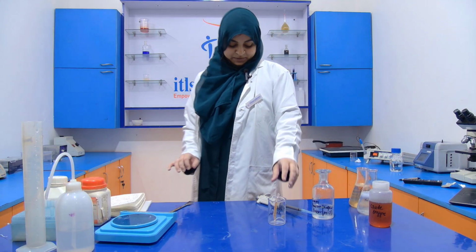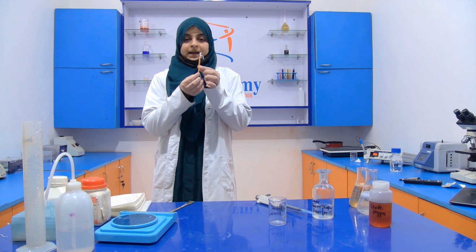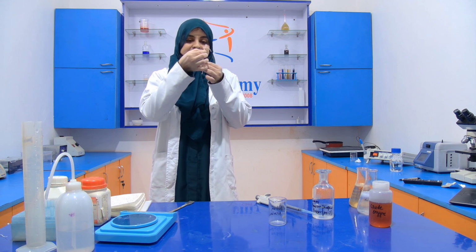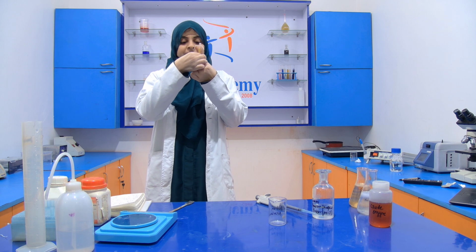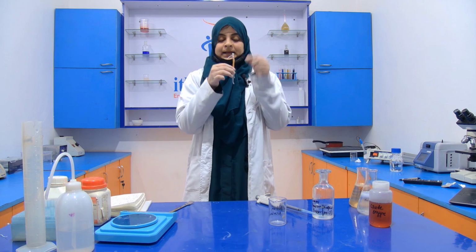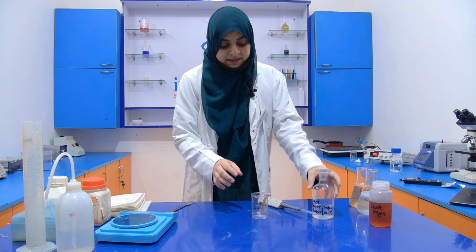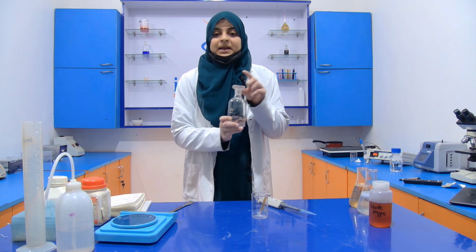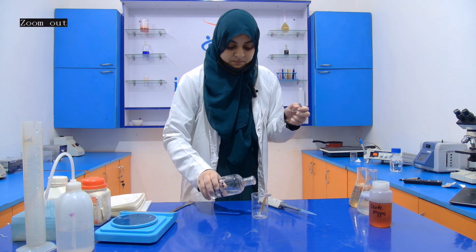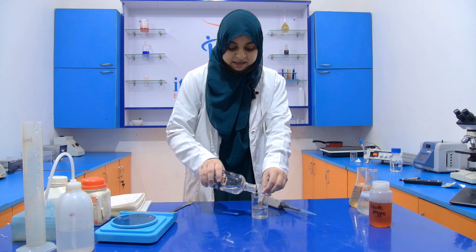Now, after tying this dialysis membrane from one end, I pour the 1 ml of this crude enzyme into it and then again tie it here. Now I kept it inside the beaker and add 50 millimolar potassium phosphate buffer so that it will completely dip inside it.